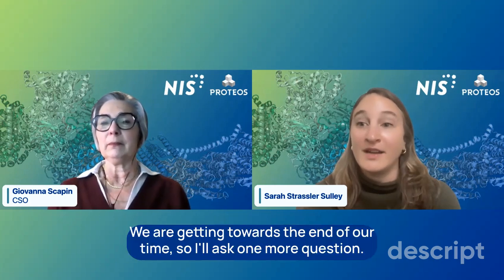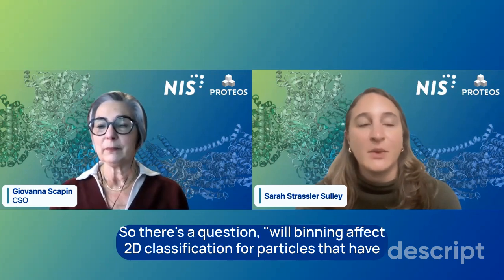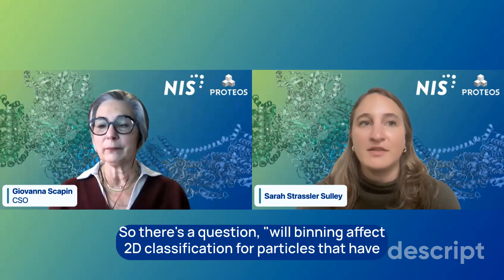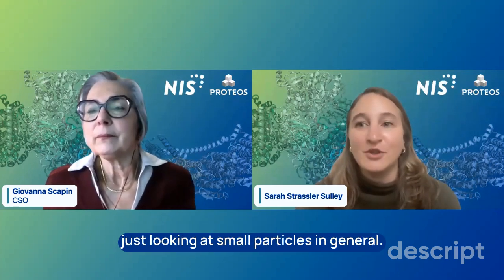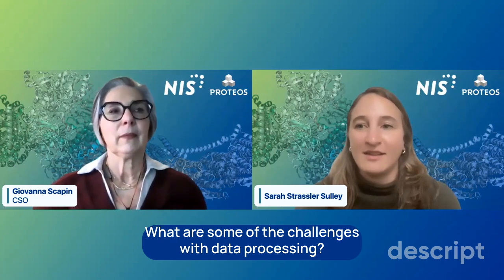Sure. We are getting towards the end of our time, so I'll ask one more question. There's a question: will binning affect 2D classification for particles that have less than 100 angstrom diameter? And then maybe you could also touch on just looking at small particles in general. What are some of the challenges with data processing?